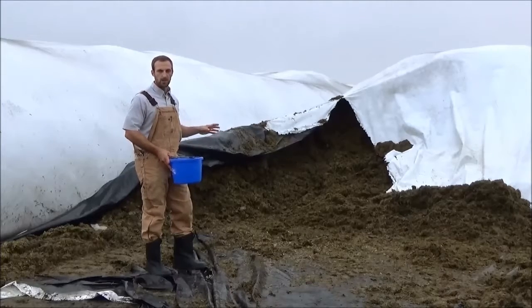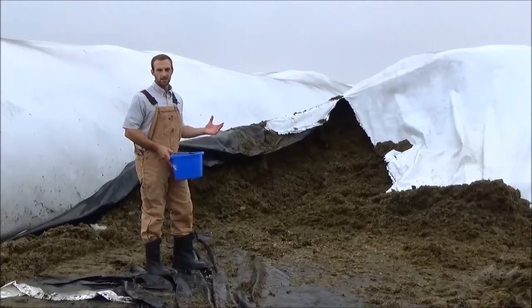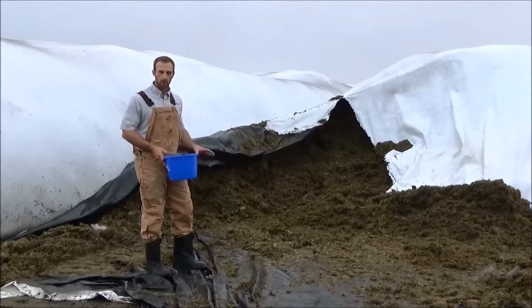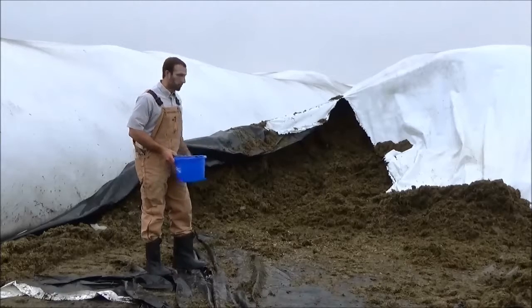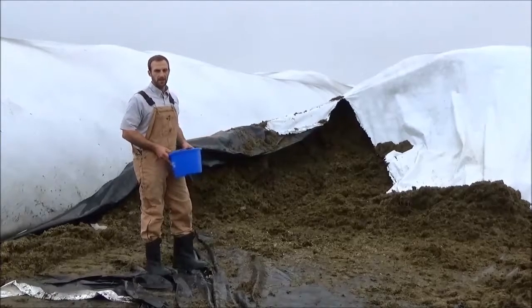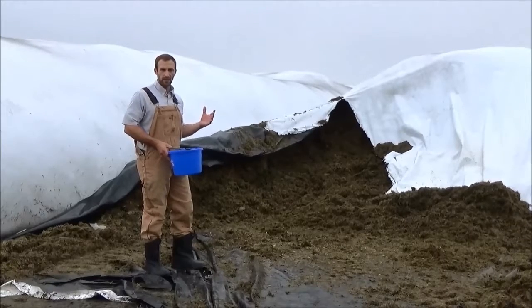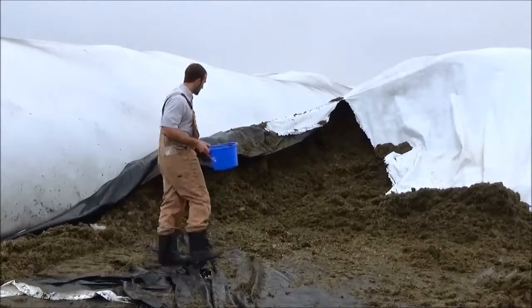In bag circumstances, I also think it's a good idea to be sampling from trucks or wagons as they're coming in to fill the bag, to have some idea of what's within the bag, and then mark that on the side of the bag. That's probably a good idea to understand what the variability is going to be. Moisture monitoring or dry matter monitoring is going to be done on the farm level as we move through and work with the bag — ideally every day or every other day, because it's going to change quite a bit.